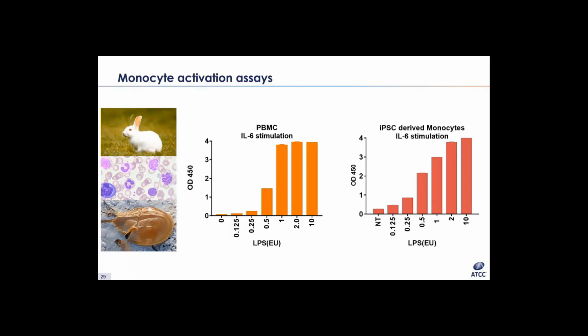So finally, there's the monocyte activation test, or MAT assay, which uses the cryopreserved blood of several human donors. While it's much more humane than the other 2 tests, it could suffer from lot-to-lot differences in quality. You have influencing factors such as lifestyle and genetic background that can differ significantly between the donors, and we just can't control for that.